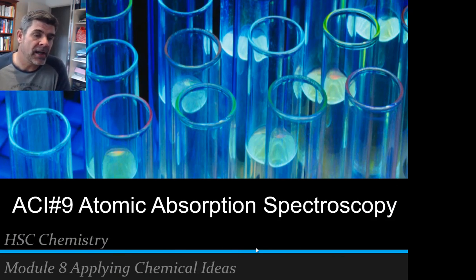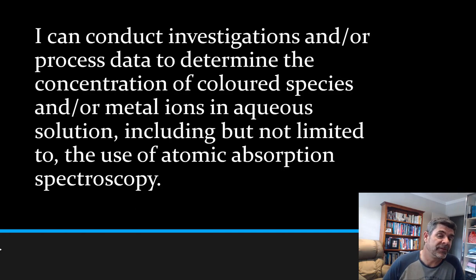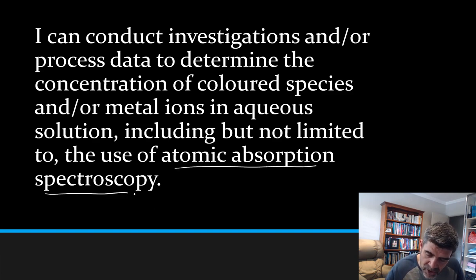This is video number 9 and we're going to look at the last of our techniques that's associated with the analysis and identification of inorganic substances, and that is atomic absorption spectroscopy. So you can see it's the same sort of deal that we've been looking at, conducting investigations and or processing data to determine the concentration of coloured species or metal ions in aqueous solutions, and this time we're focusing on the technique of atomic absorption spectroscopy, or AAS.